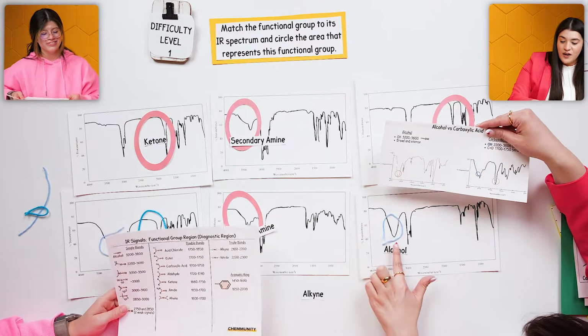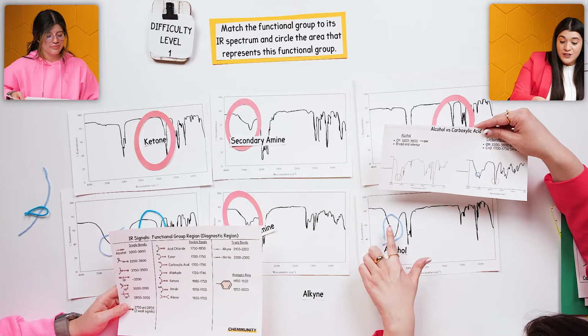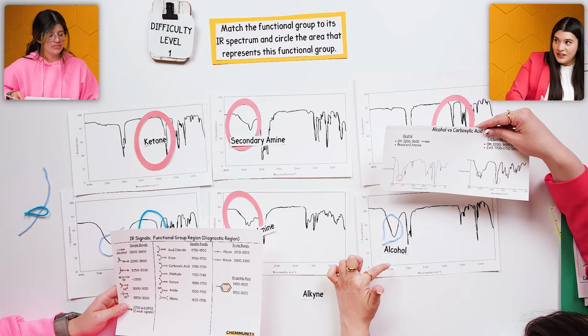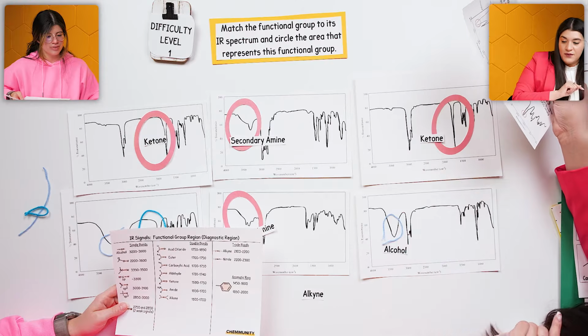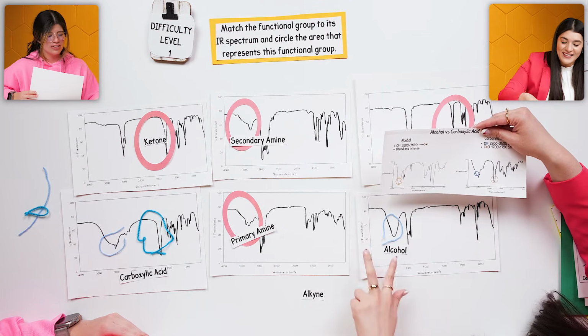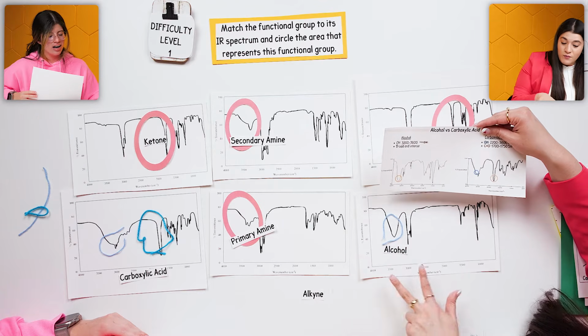We saw that this was broad. It might not be too intense or strong because it's not as low down compared to these that we've seen. But it is broad. It is kind of fatter, as you can think of it. It's not narrow. So that's really it.